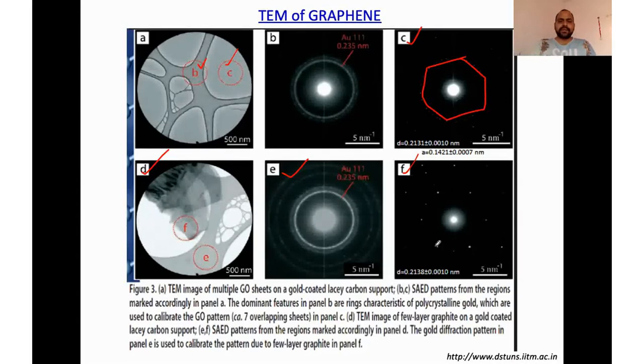However, see some atoms have a slightly blank spot. See this region, this region, this region, this area. These are all defects, where there are some vacancies or voids.